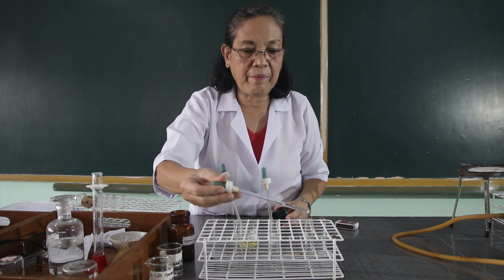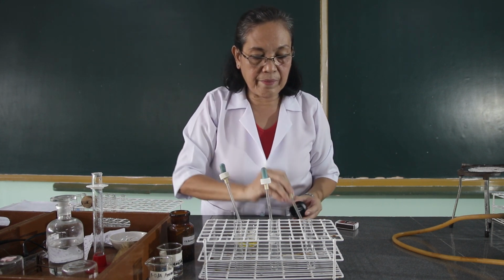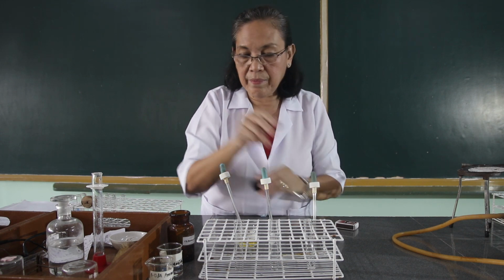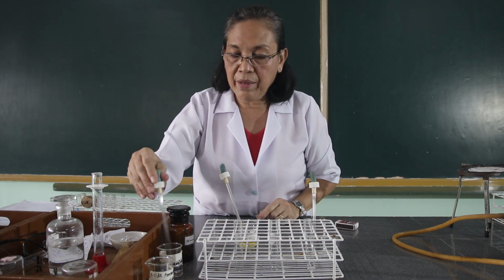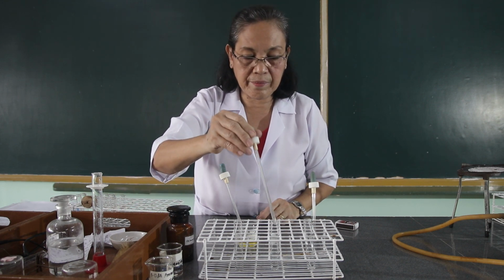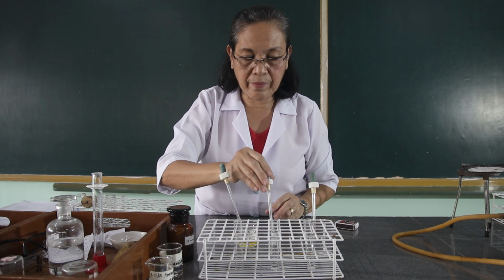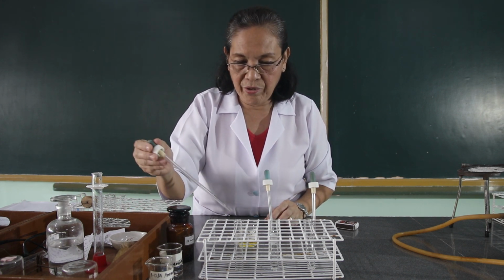So again, 1 ml of the sodium chloride. 1 ml of the potassium chloride. And 1 ml of the ammonium chloride.